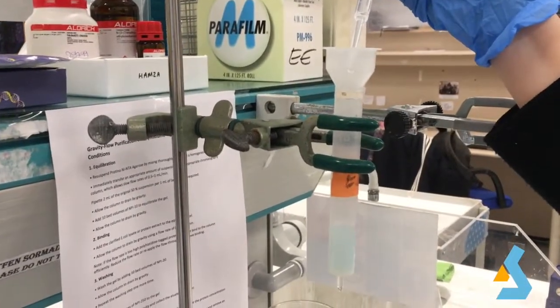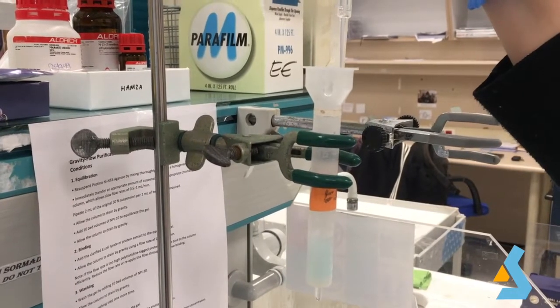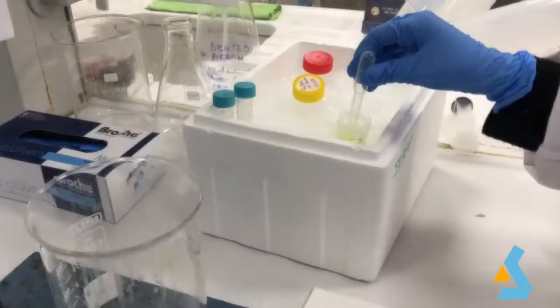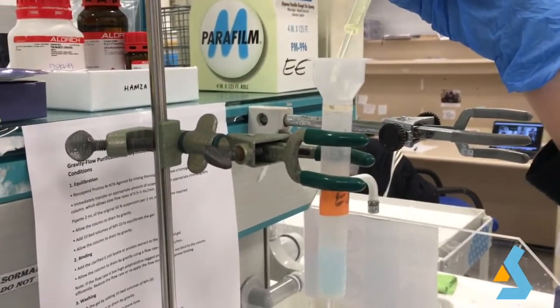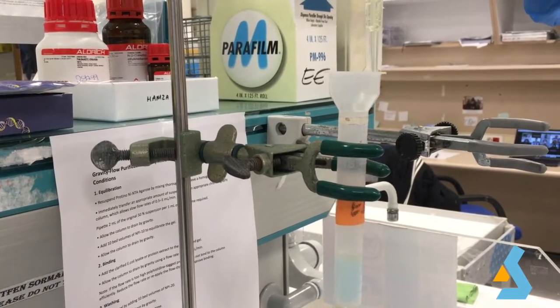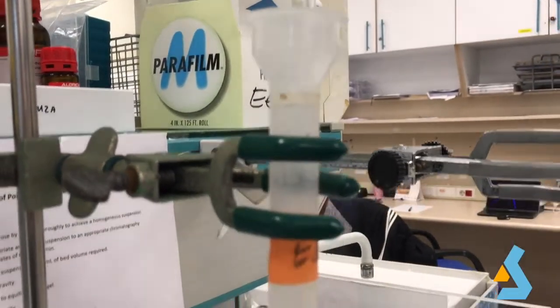While adding the buffers, use a Pasteur pipette and add each solution from the edges of the column gently. Next, add the bacterial lysate supernatant into the column. The yellow color will guide the location of the protein. After adding the whole supernatant, let the liquid flow by gravity.